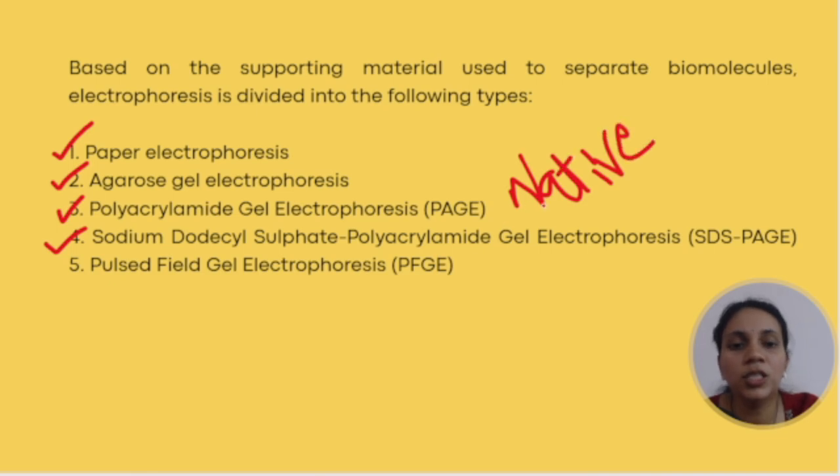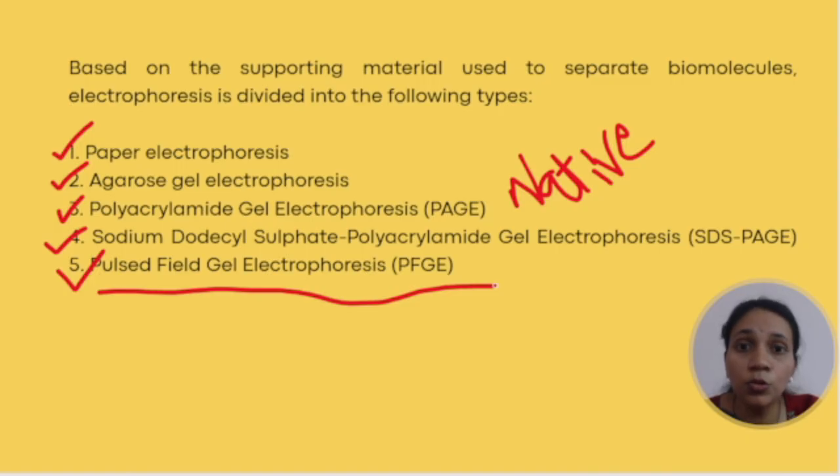In native PAGE, it is used when we want to study the intact protein molecule. And another one is pulsed-field gel electrophoresis. This particular method is especially used in studying certain zoonotic organisms. Okay, so it is used as a gold standard method.